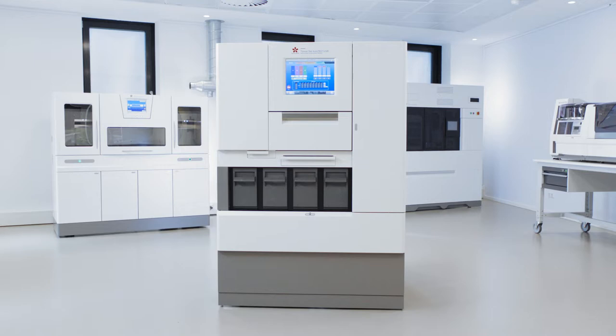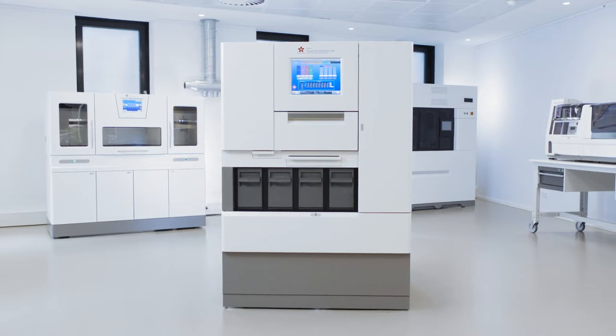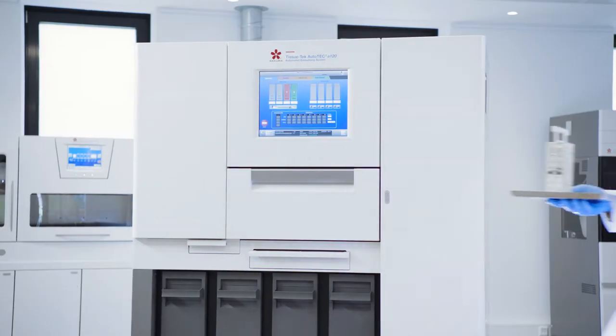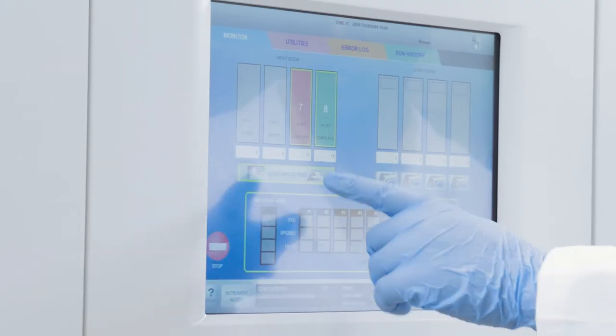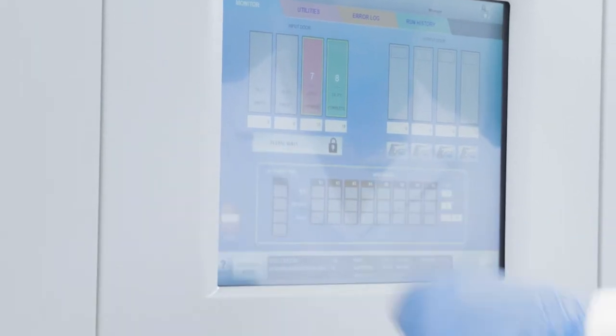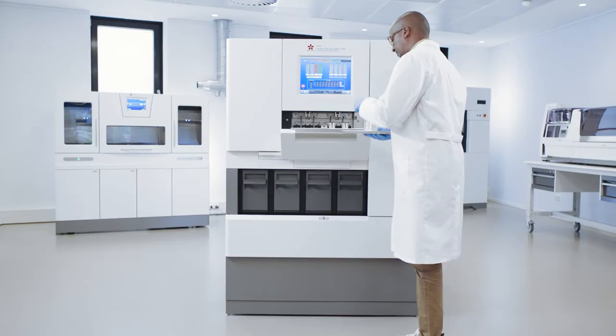Tissue must always be taken care of in the correct way, delivering consistent quality again and again, so that we can focus on crucial matters in my laboratory.